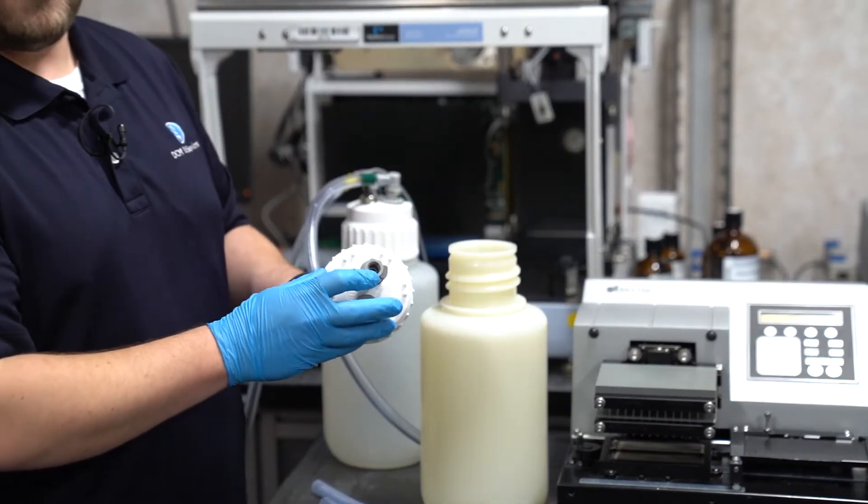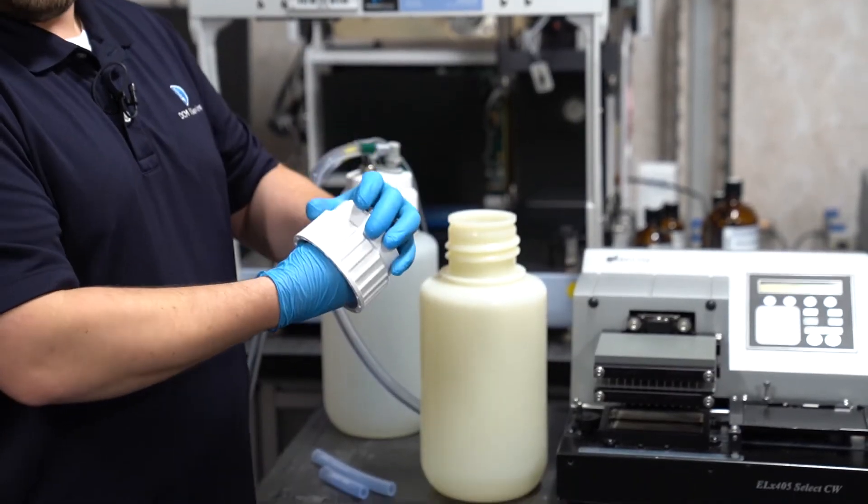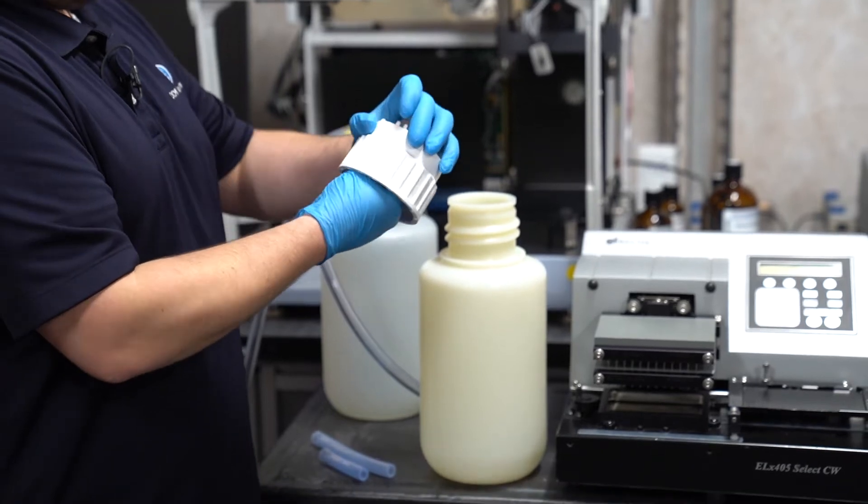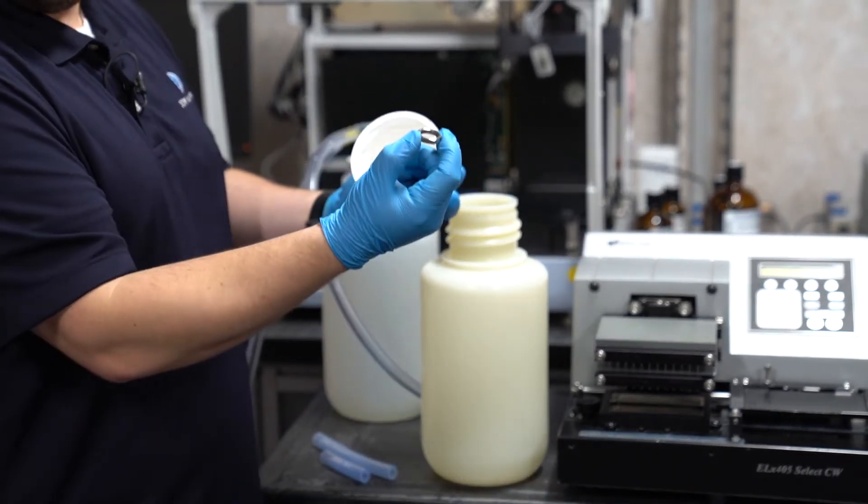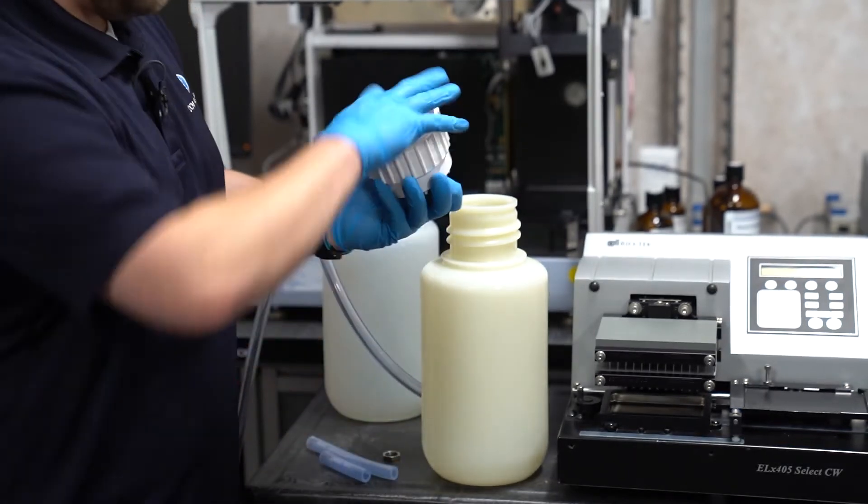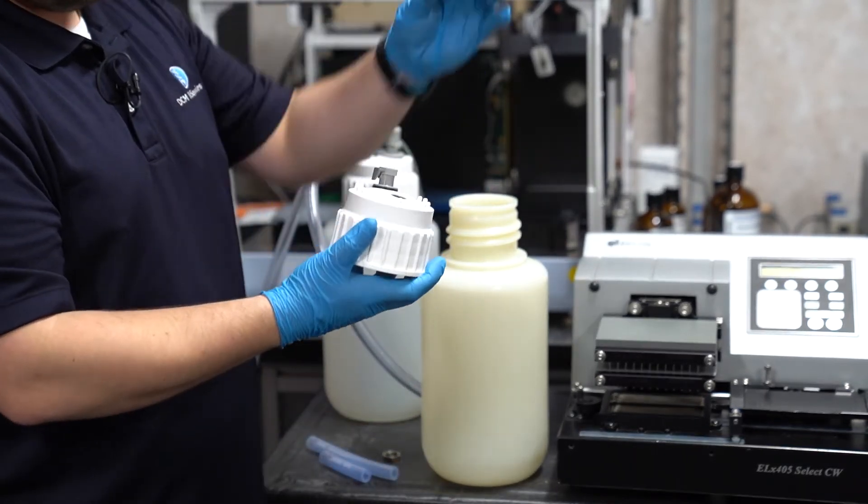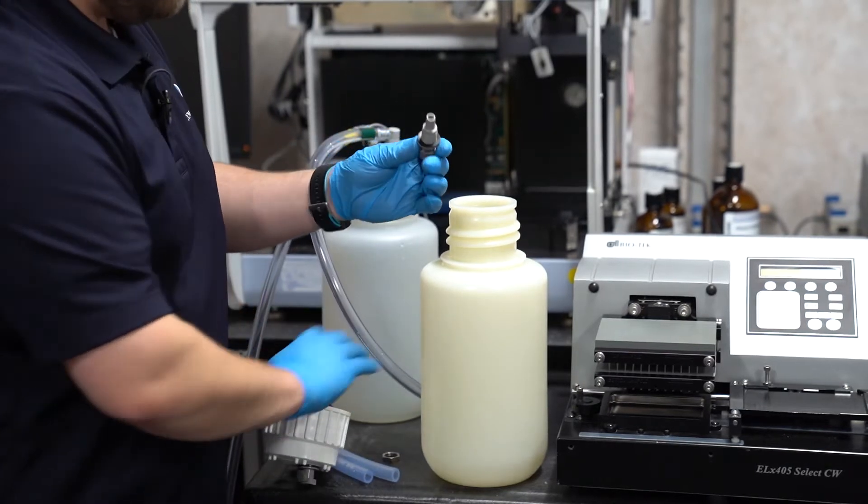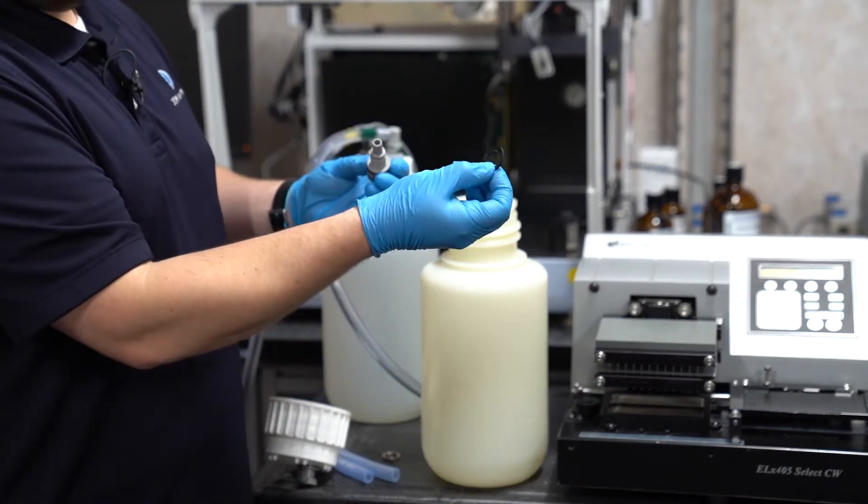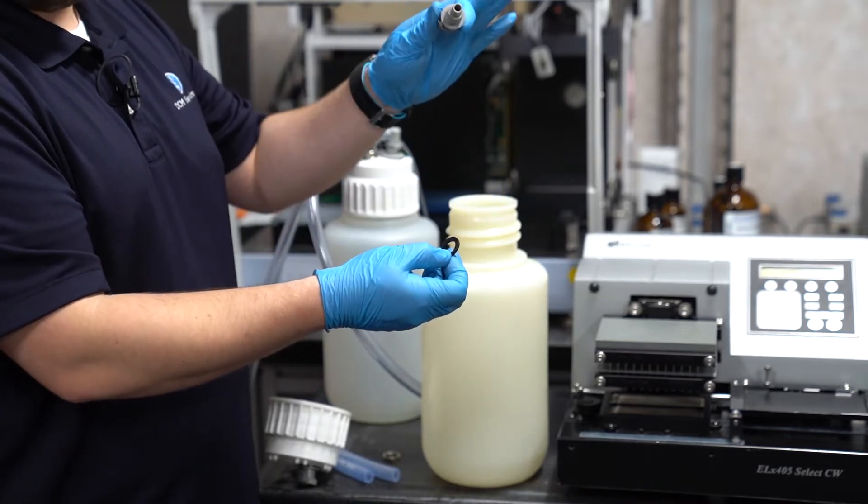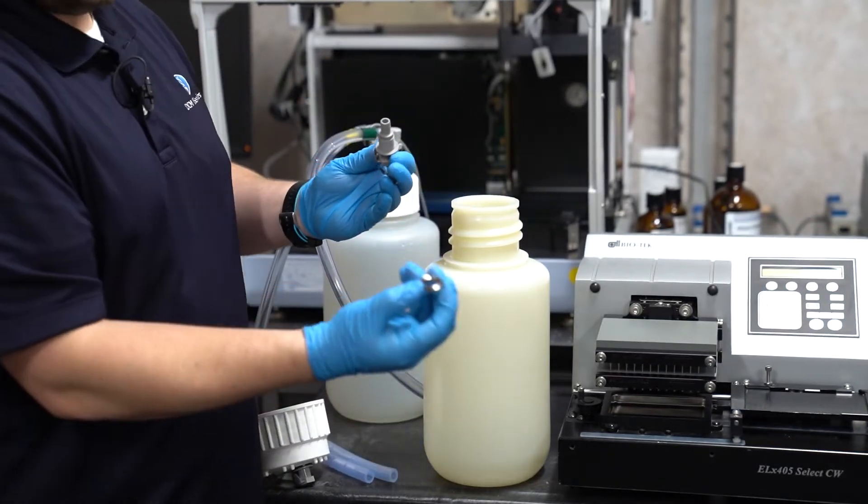Should you need to replace one of these fittings, simply loosen the lock nut, and remove it from the end of the fitting, and pull the female fitting up and through the top of the cap. Here we can see the individual components. We have the fitting gasket, the female fitting itself, and the lock nut.